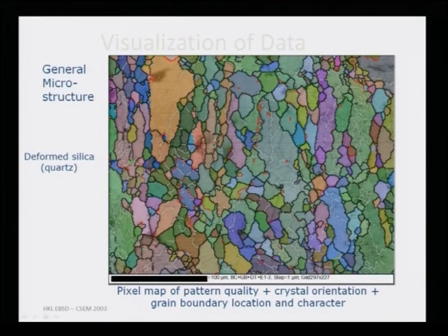Once you obtain the orientation of the grains, we can create a color map or grain orientation map, which is routinely done, and this provides us lots of information regarding the orientation of the grain boundary, the type of defects present, and many other things which we will discuss after we see the actual EBSD in the microscope in the subsequent lectures.